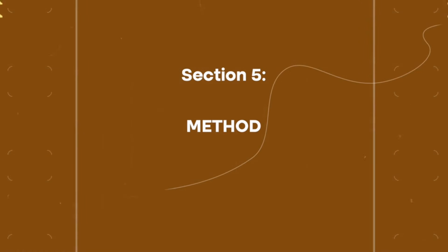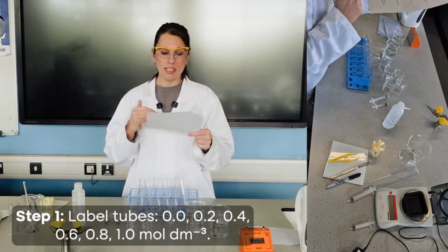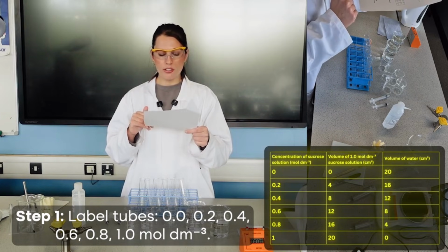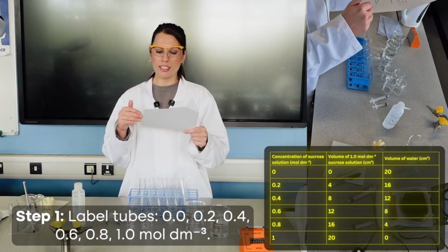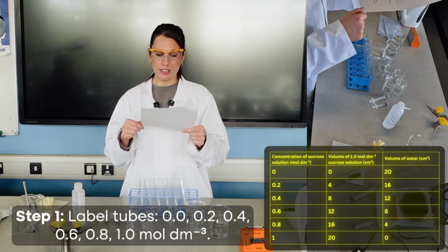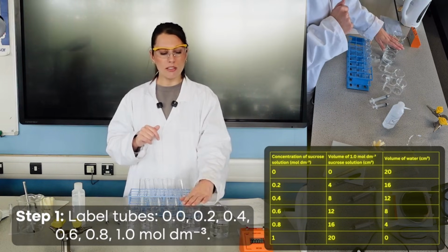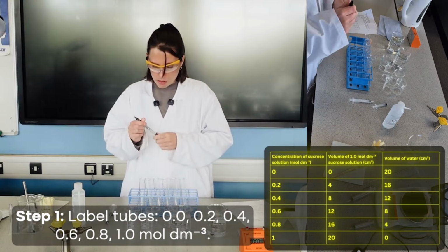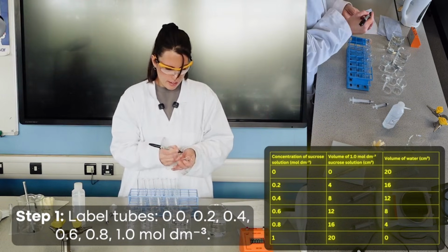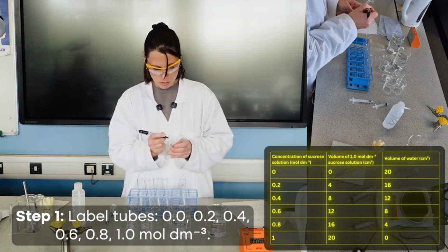So my first step then is to create my dilution series. We can see here on the table, these are the different concentrations of sucrose solution that I'm going to be making: 0, 0.2, 0.4, 0.6, 0.8, and 1 moles per decimeter cubed. And we've got the different volumes there in the table that I'll need to add of my distilled water and of my sucrose solution. So I'm actually going to label my boiling tubes now. This will be my 0, so that'll be just distilled water.